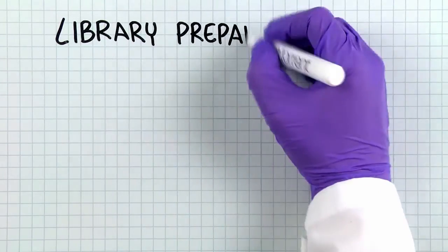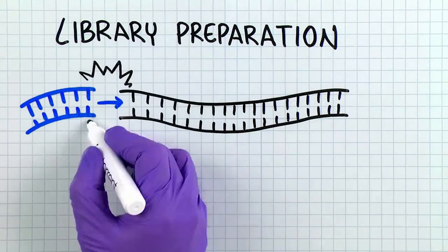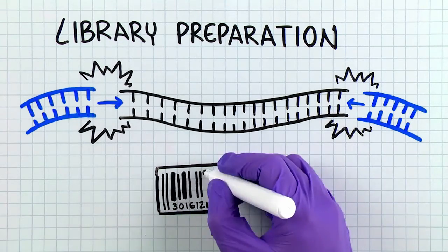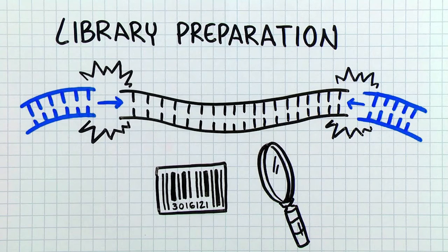Well, this all sounds great, but you may be asking yourself, how does it work? And how many samples can I fit on my sequencing run? Well, let's take a look at our lab book. During library preparation, barcodes, or index sequences, are added to the DNA or RNA libraries to be sequenced. Each sample will have a unique barcode sequence that allows the software to identify and group the sequencing reads from each sample. So how does one calculate how many samples to multiplex on a sequencing run?